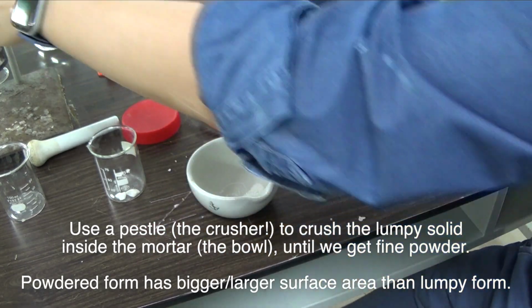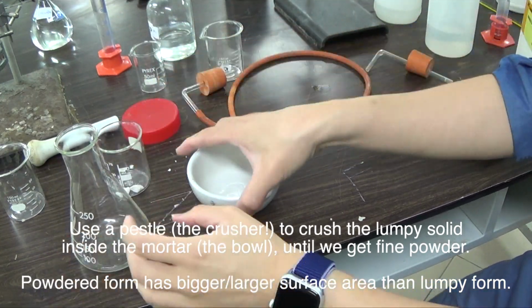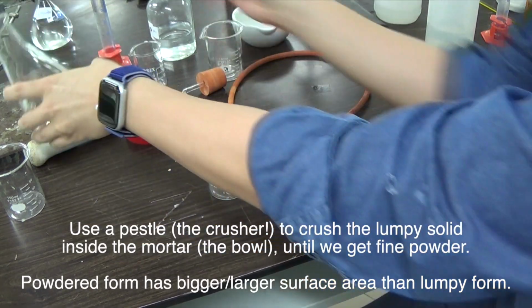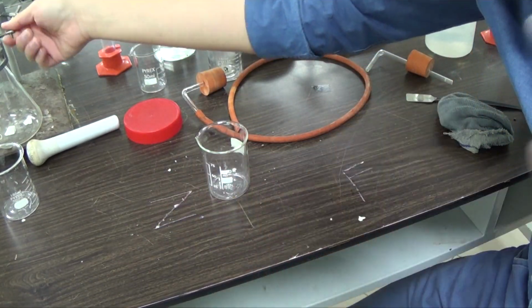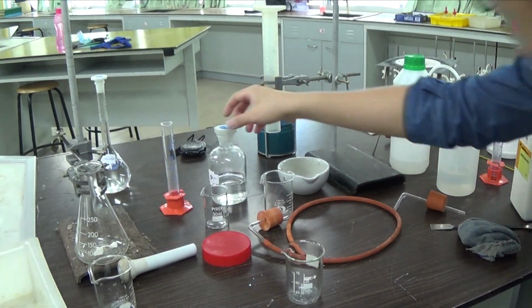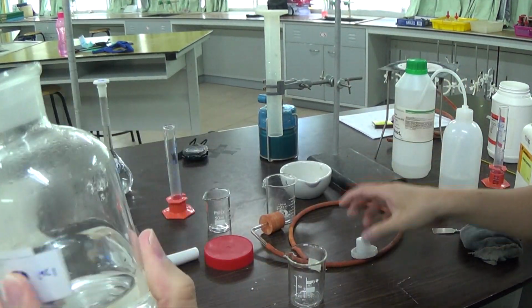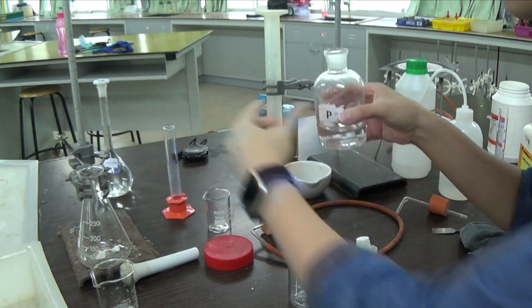So I will have a conical flask. In this conical flask, I'll put in the 2 gram of the solid. And this is calcium carbonate. So carbonate plus acid will give me a gas. The acid I'm going to use is hydrochloric acid. Hydrochloric acid has this formula, HCl.